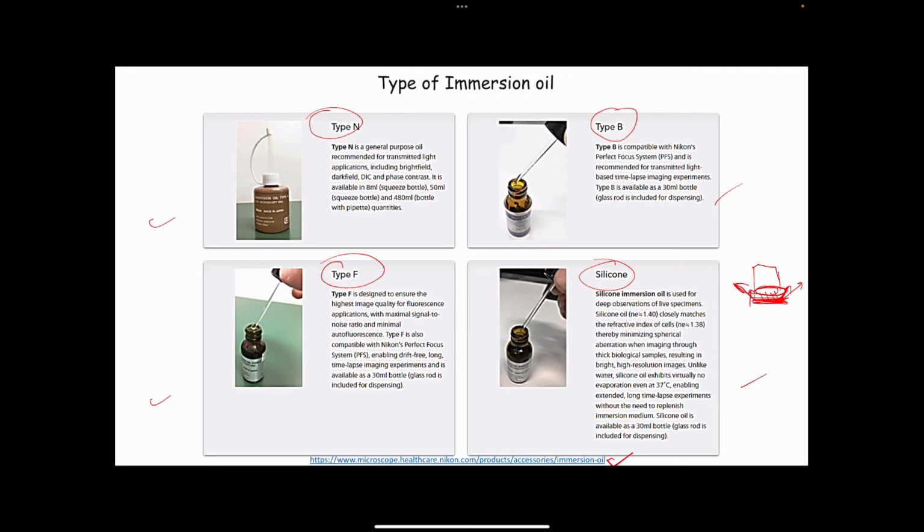Eventually you will lose those rays and compromise on your performance. That's not what we want. It can also lead to aberrations, which are minimized by using the oils that the company provides with their objectives.